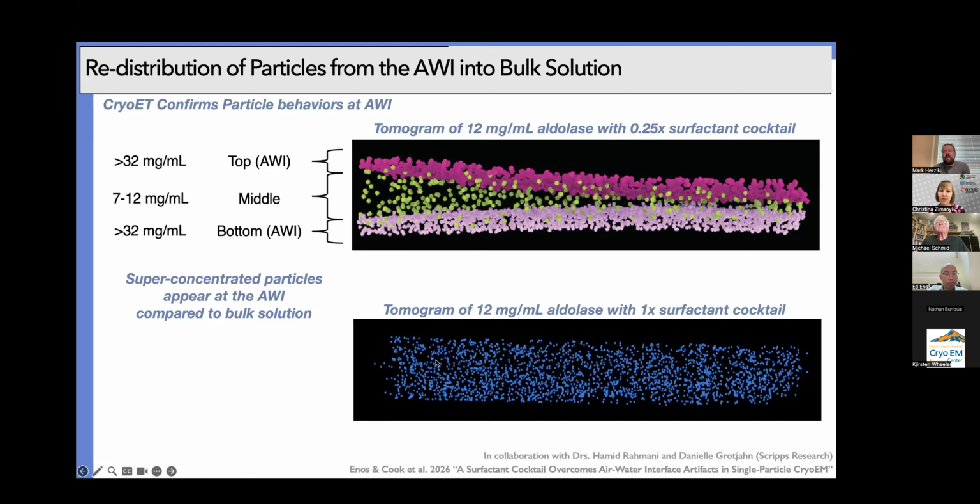In that case, it is sometimes hard unless you have something with a big domain that's missing, or you see the complex start to fall apart. Another thing is that this denatured object on top, or even mixed in with your protein, actually affects the orientation search that you're doing anyway. So the pose is not the right pose for the rest of it.